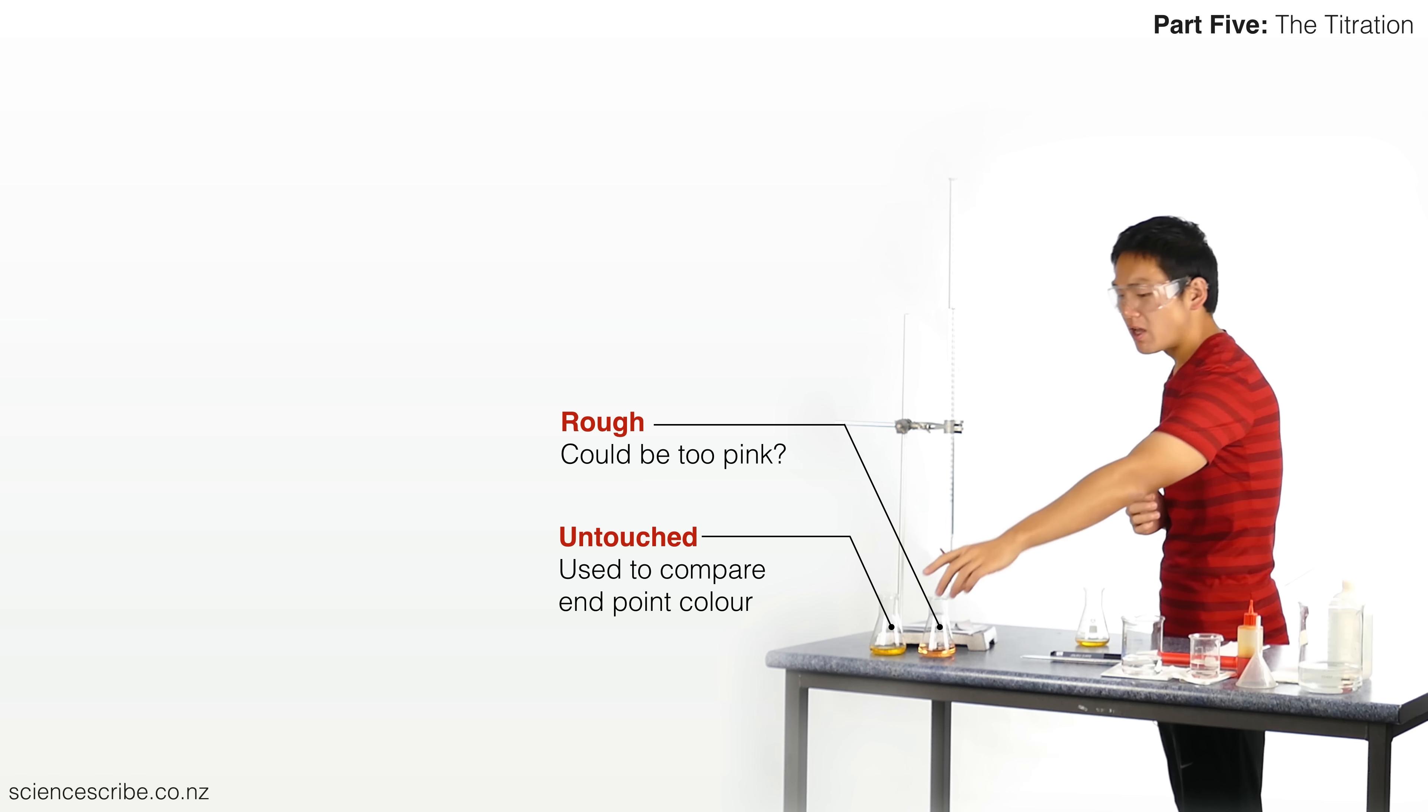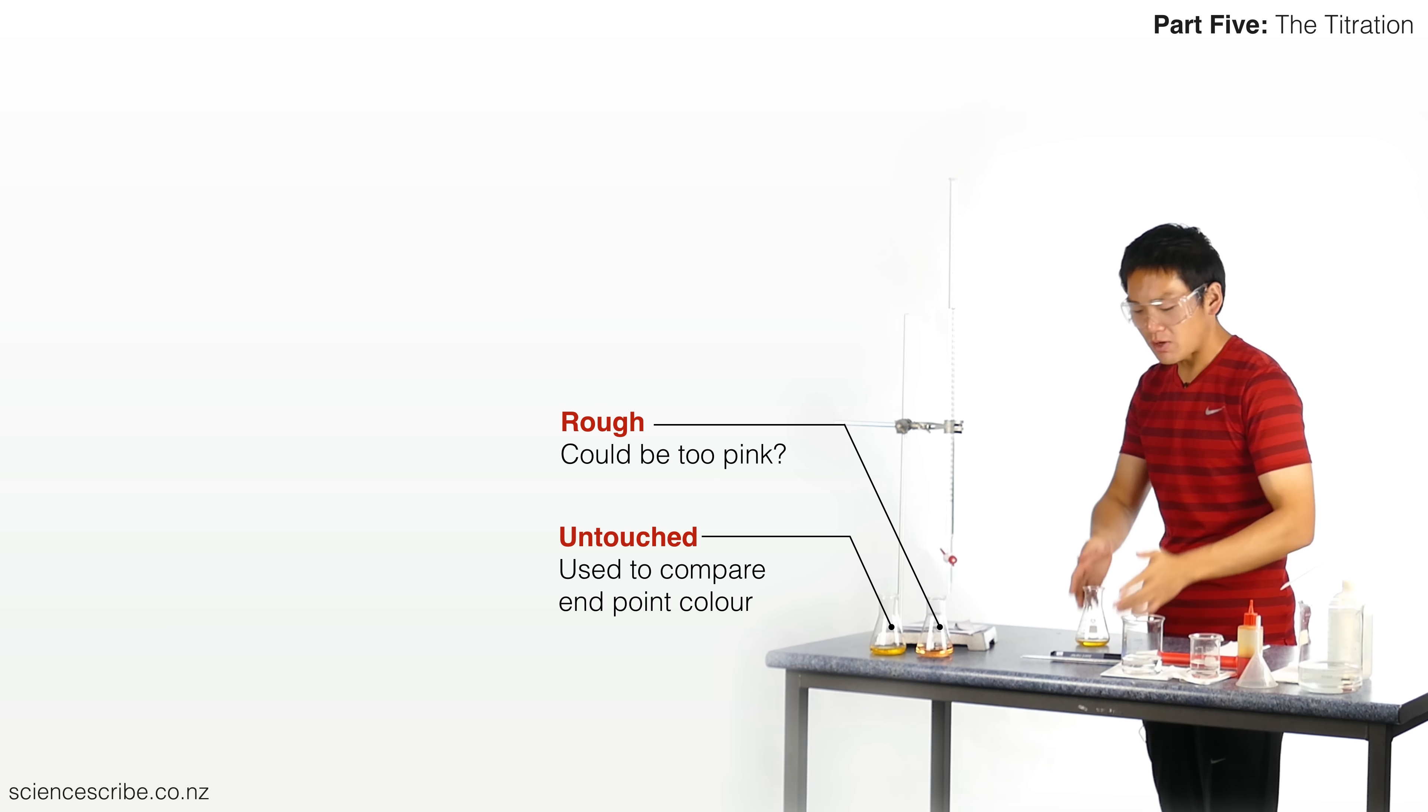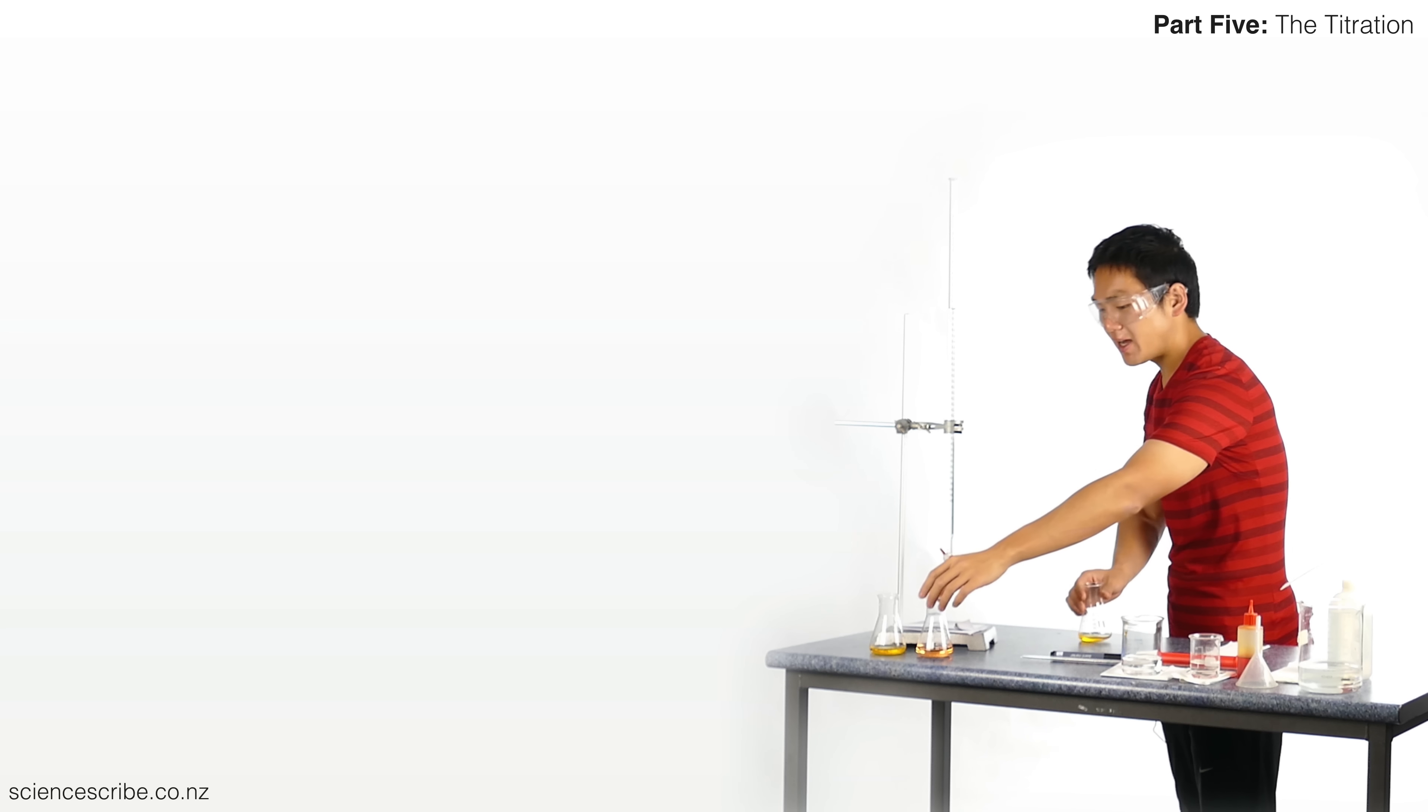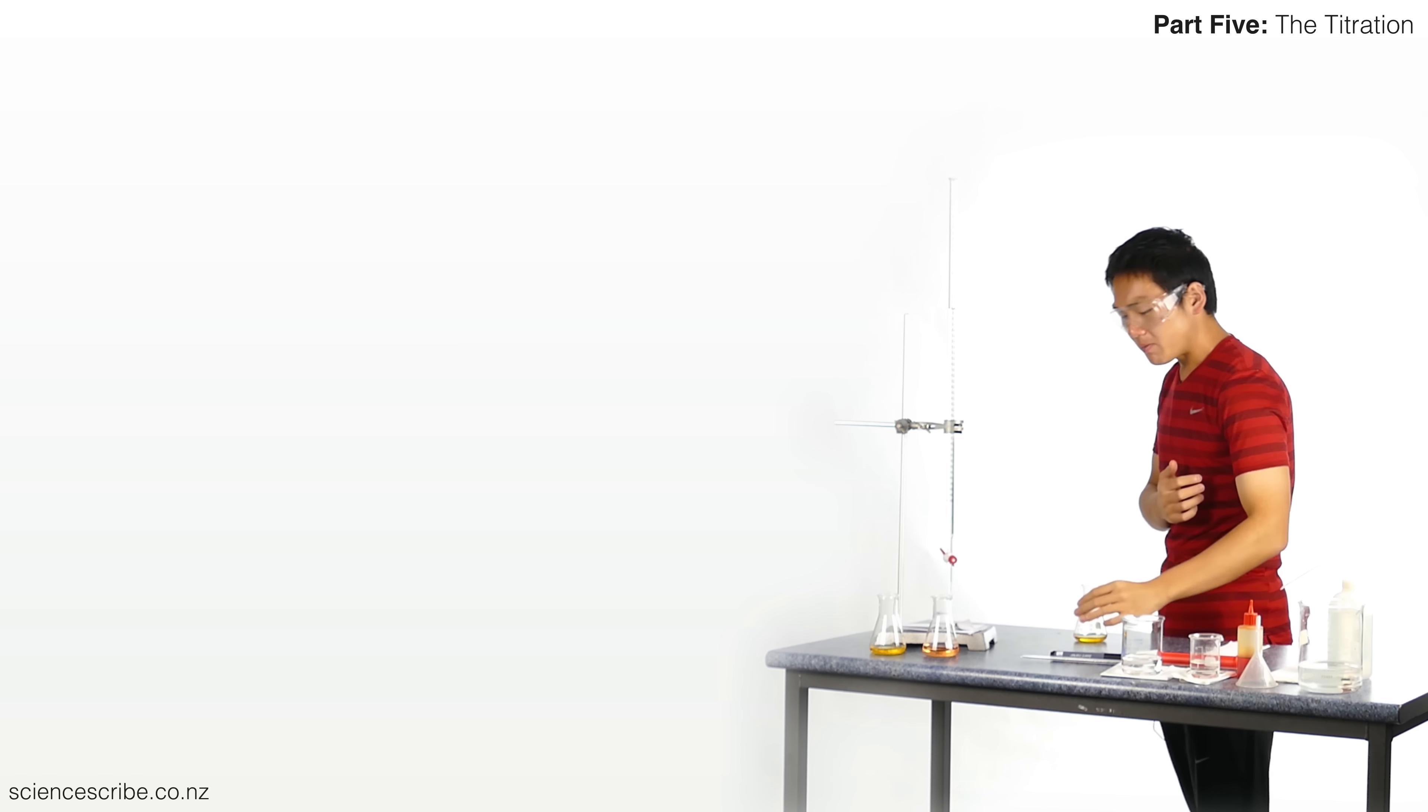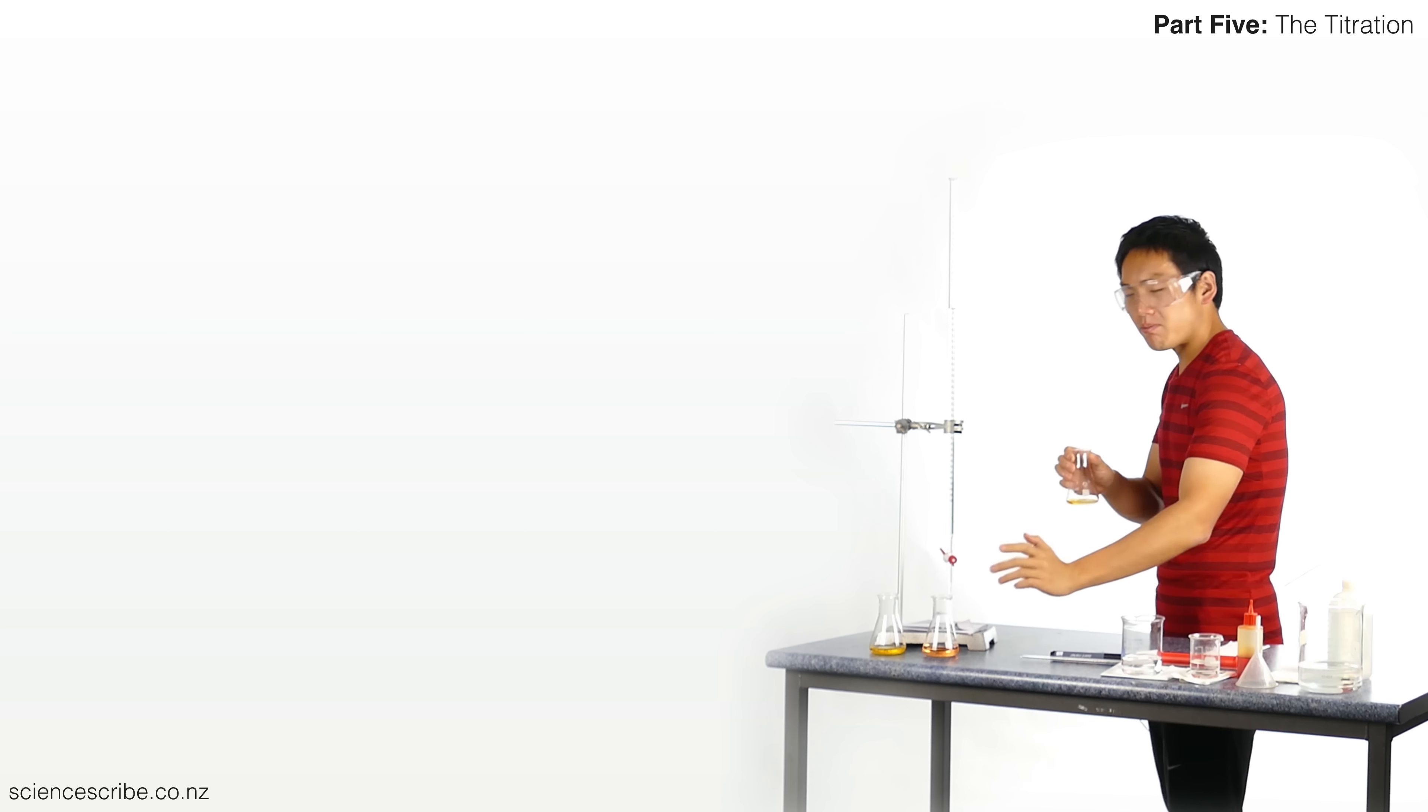You'll also notice that I've kept my original flasks. I always keep my old flasks and don't wash them out because I want to compare my next color to my other colors. The last titration I did, which was a rough titration, ended up with this color. If I took this up to someone they could probably tell me it's peachy, but I'm actually not too sure myself if it's a little bit on the pink side. So I'm keeping it there, and when I'm doing my titration I'm going to look for a new shade that might be better than that.